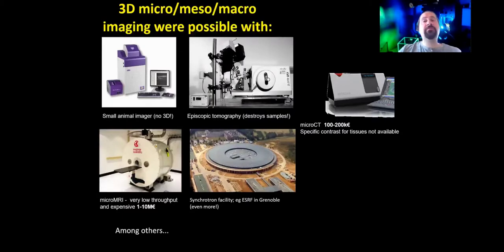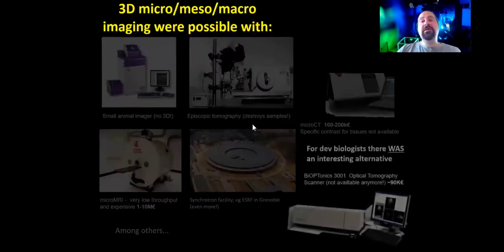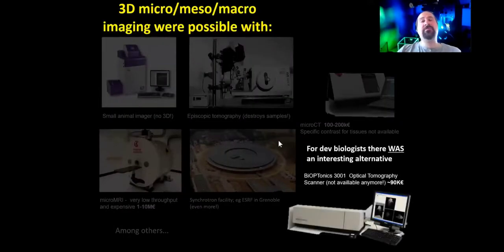be able to see anything. Now, there's beautiful work done with micro CTs out there, which requires basically preparing the sample with some kind of radio opaque chemical, but it's still not very common or an easy technique for most biologists. Thinking of that, James Sharp developed and then later created a company that created an optical tomography scanner for light instead of X-rays.